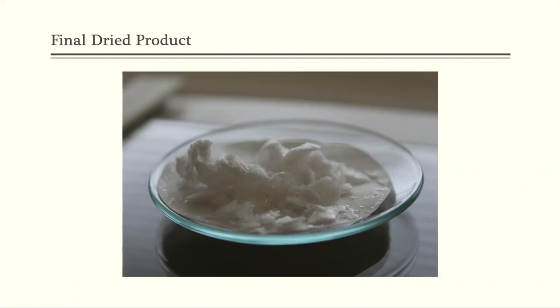Just one more image of the dried crystal here, so that way you could see it a little bit closer up. Again, the shape of the crystals did not change. It was very fluffy. It was very light. It was very rod-like. It was very jagged. And those are the things that I look for in a very good crystal formation here. So again, I'm very pleased with my recrystallization technique.